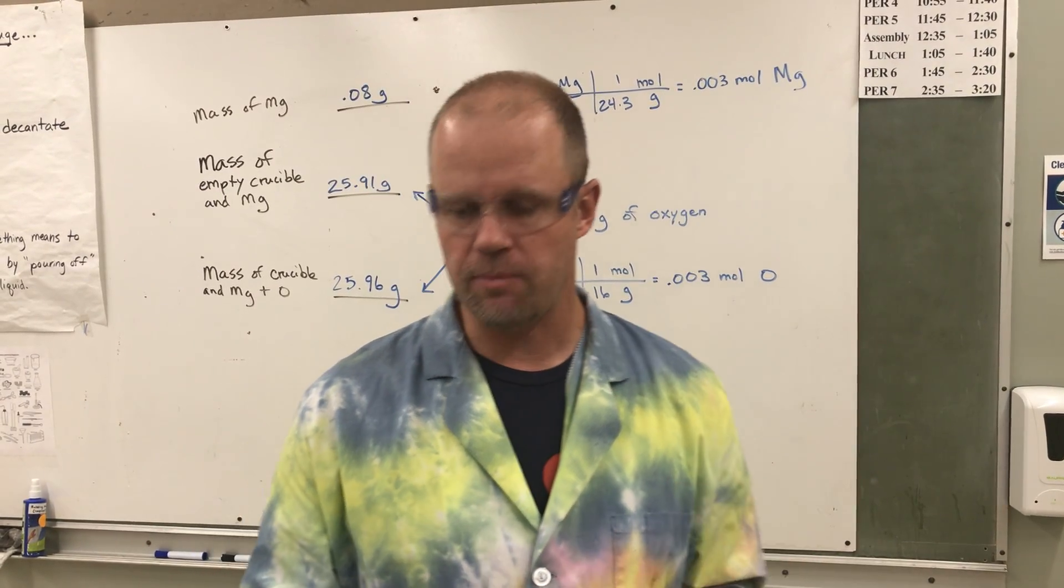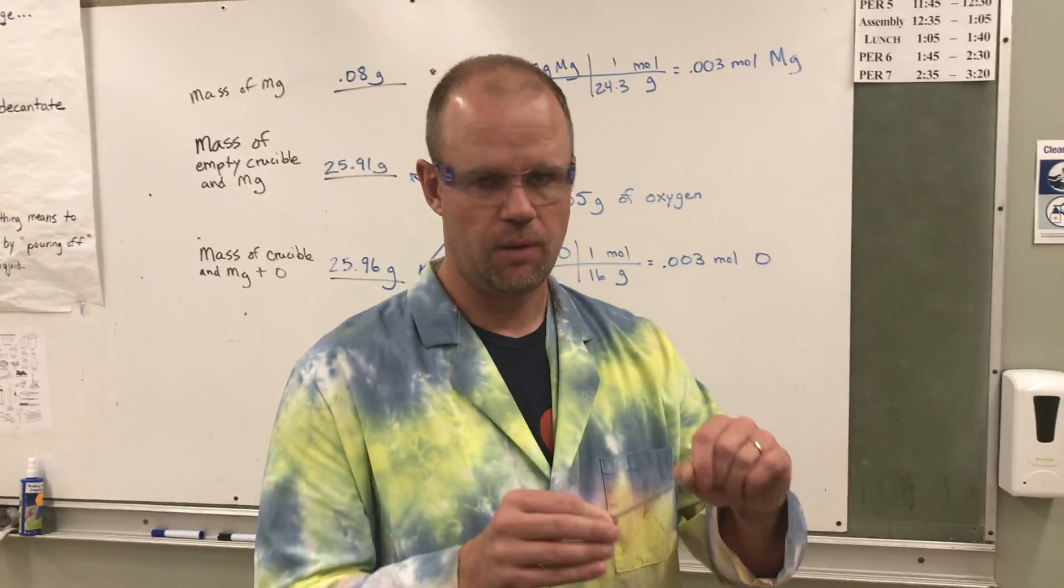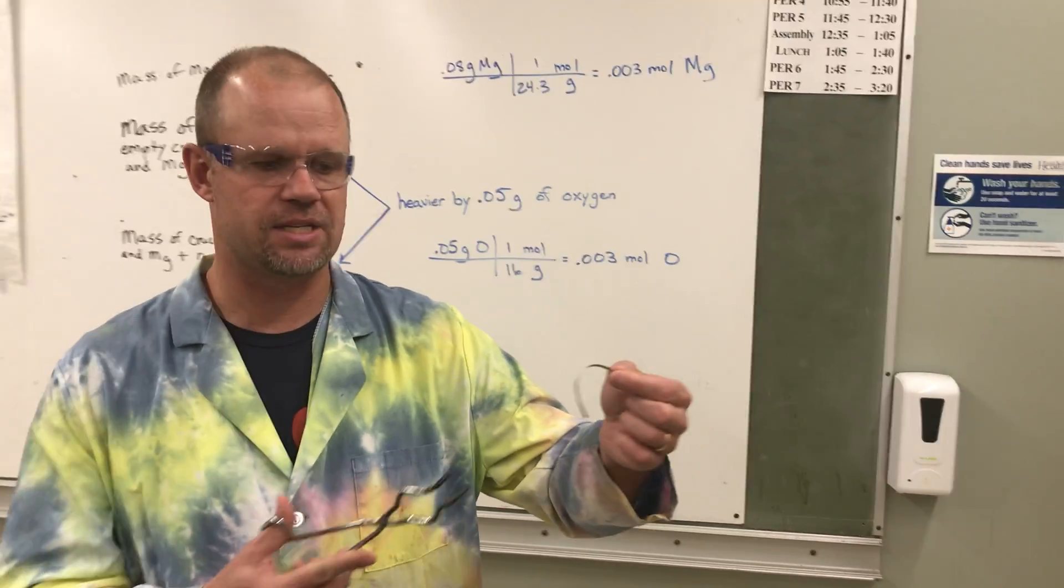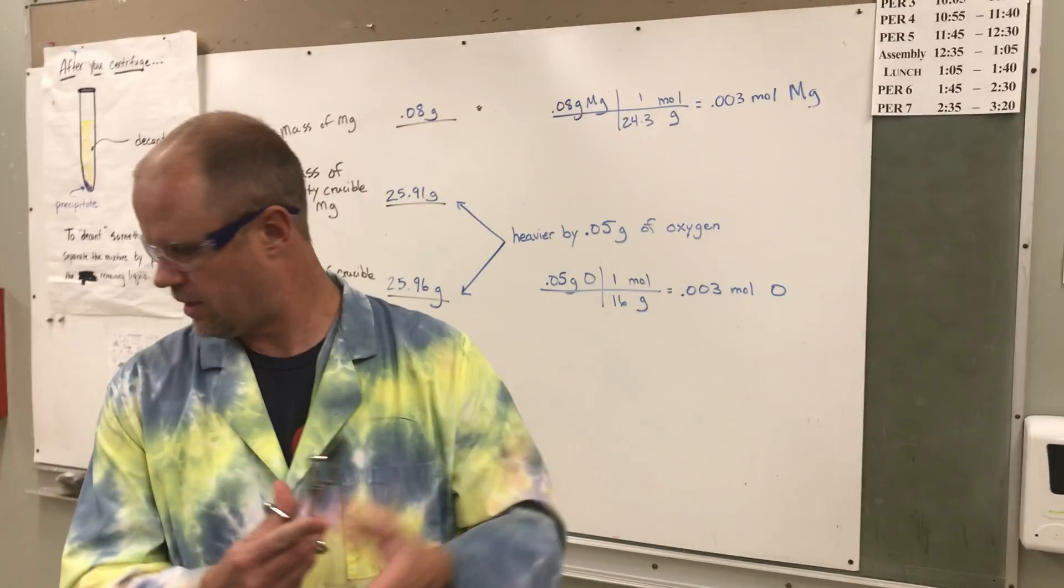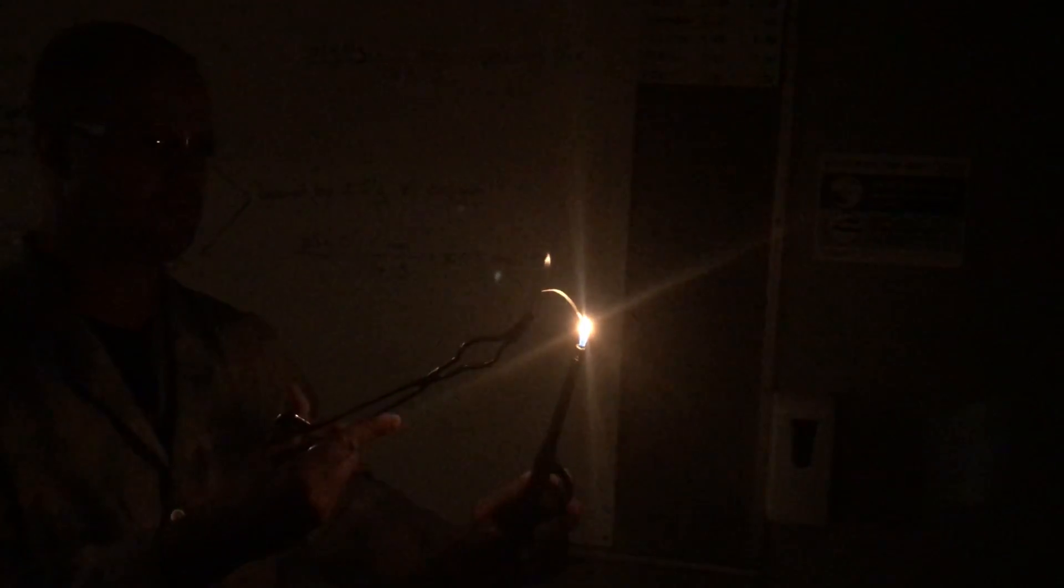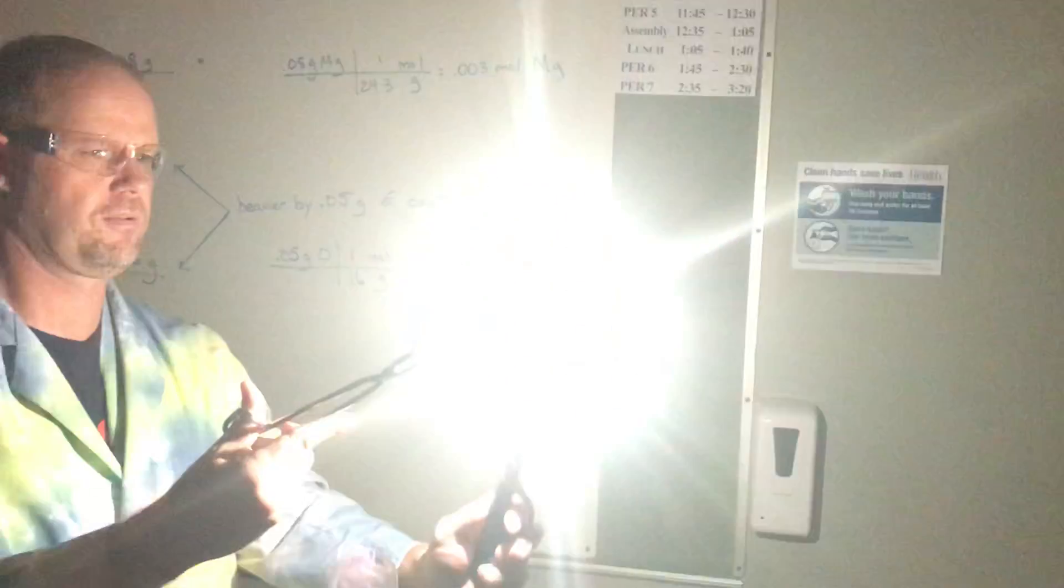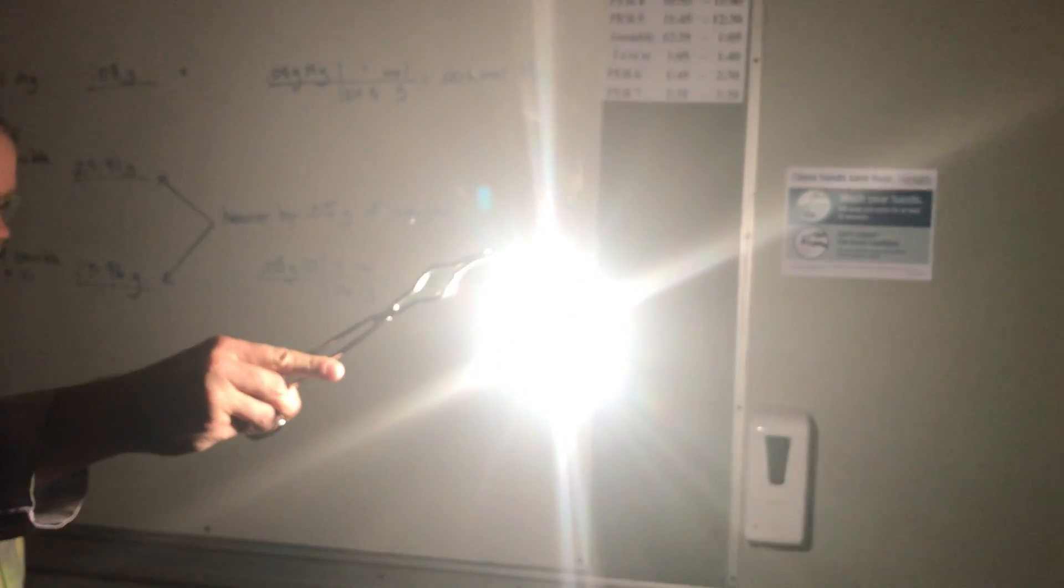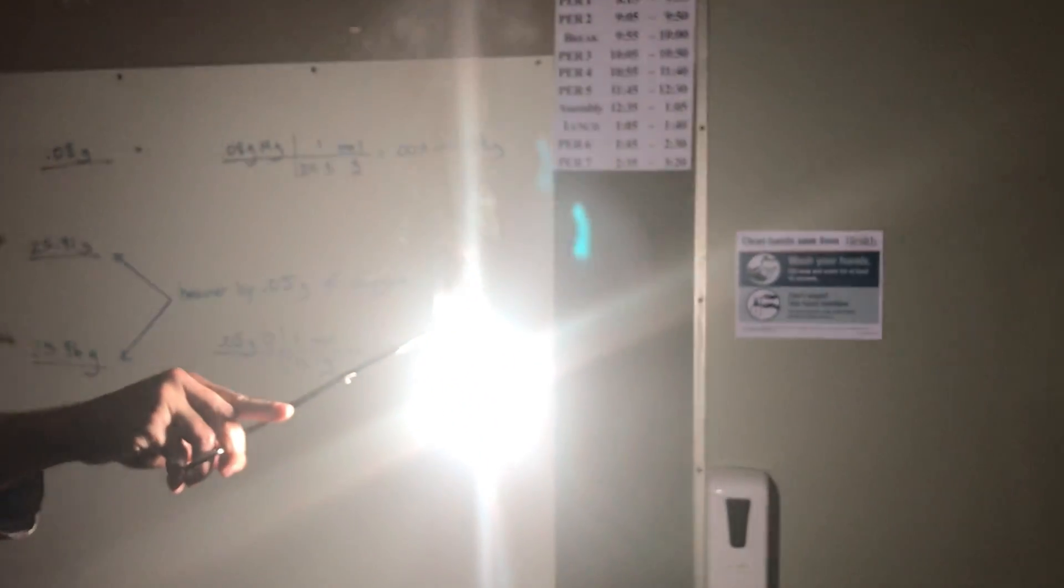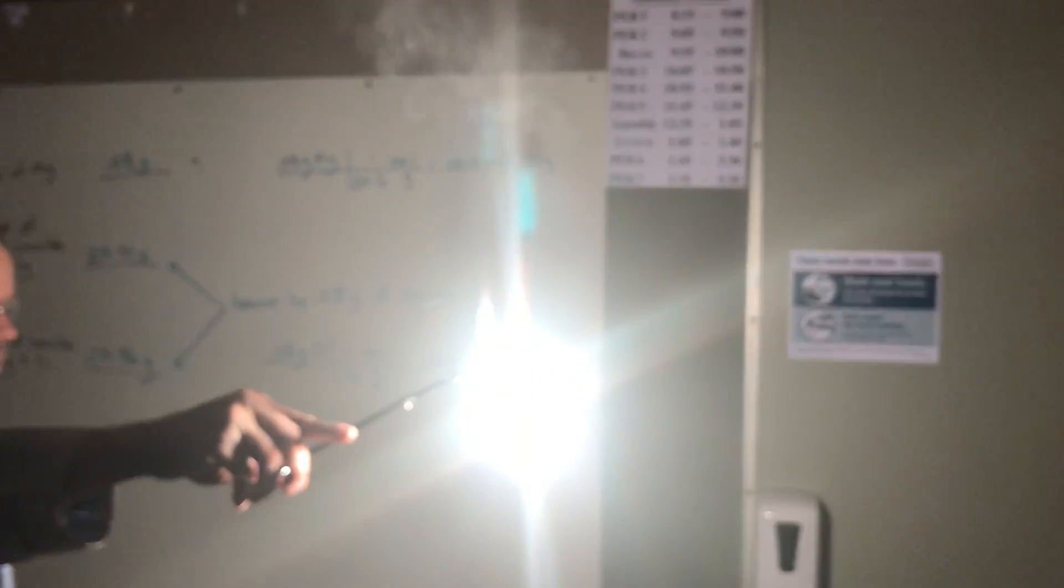Now I've done some pre-measurements here, and we're going to take a look at what this does. But before we jump into those measurements, I just want to show you what kind of reaction is happening inside here when we can't see it. I'm going to try to get it to react with the oxygen out here. You can see that's a really bright light. It's almost like welding. You have to kind of look away for a while, otherwise it hurts your eyes. And right now it's reacting with oxygen.